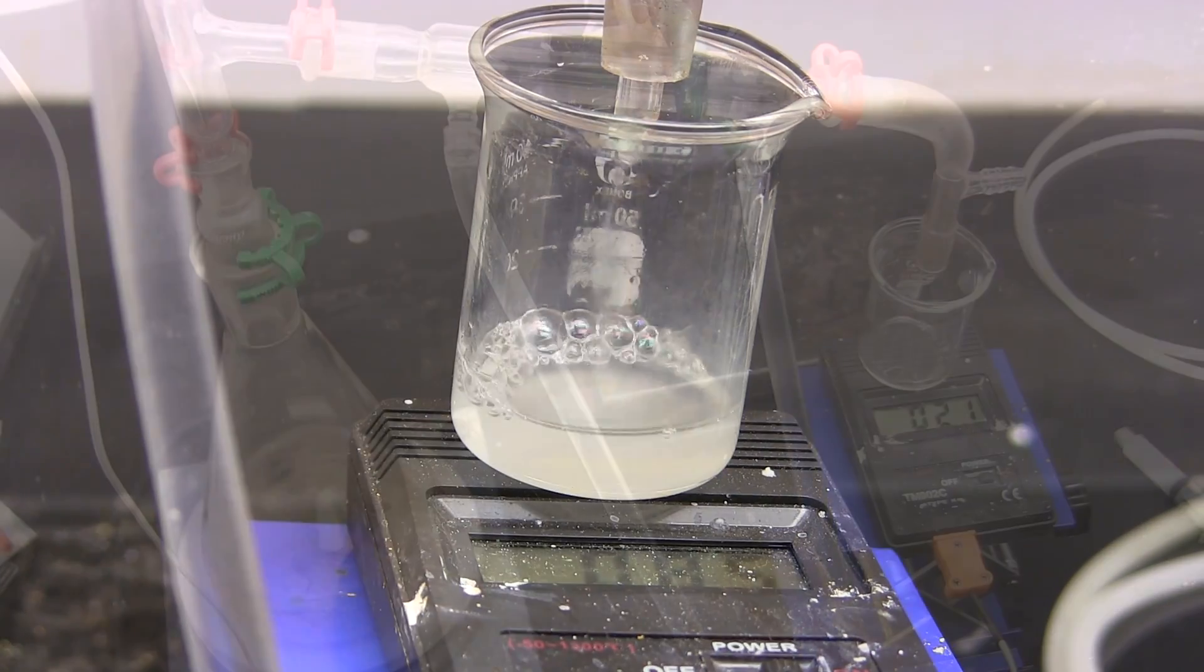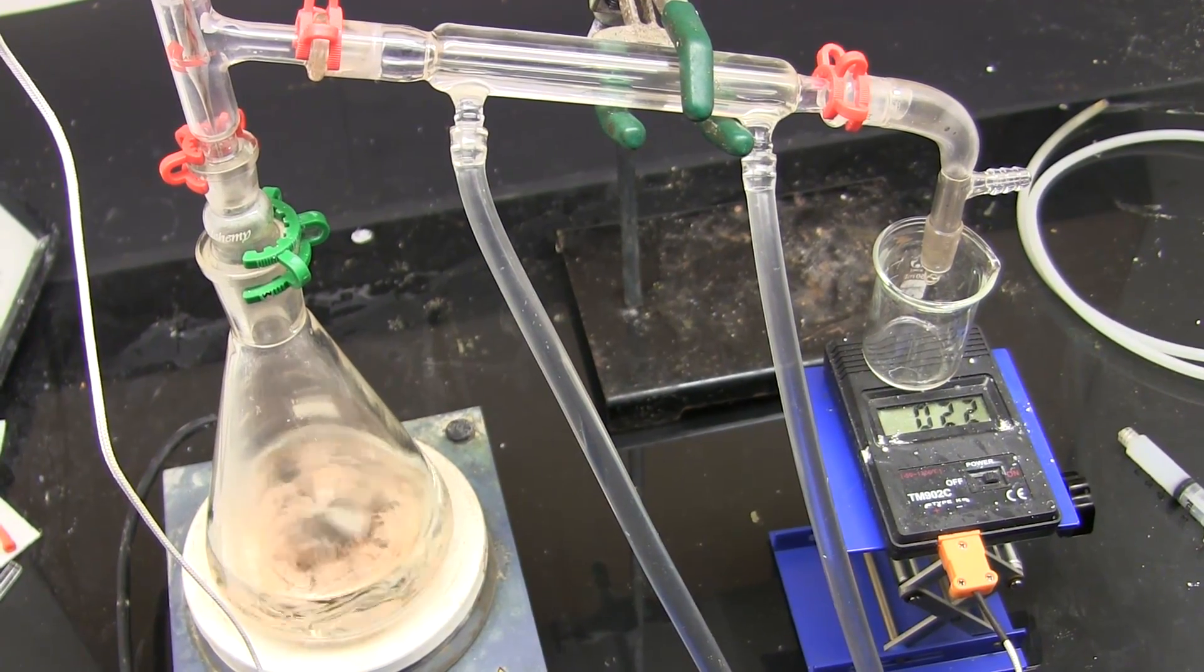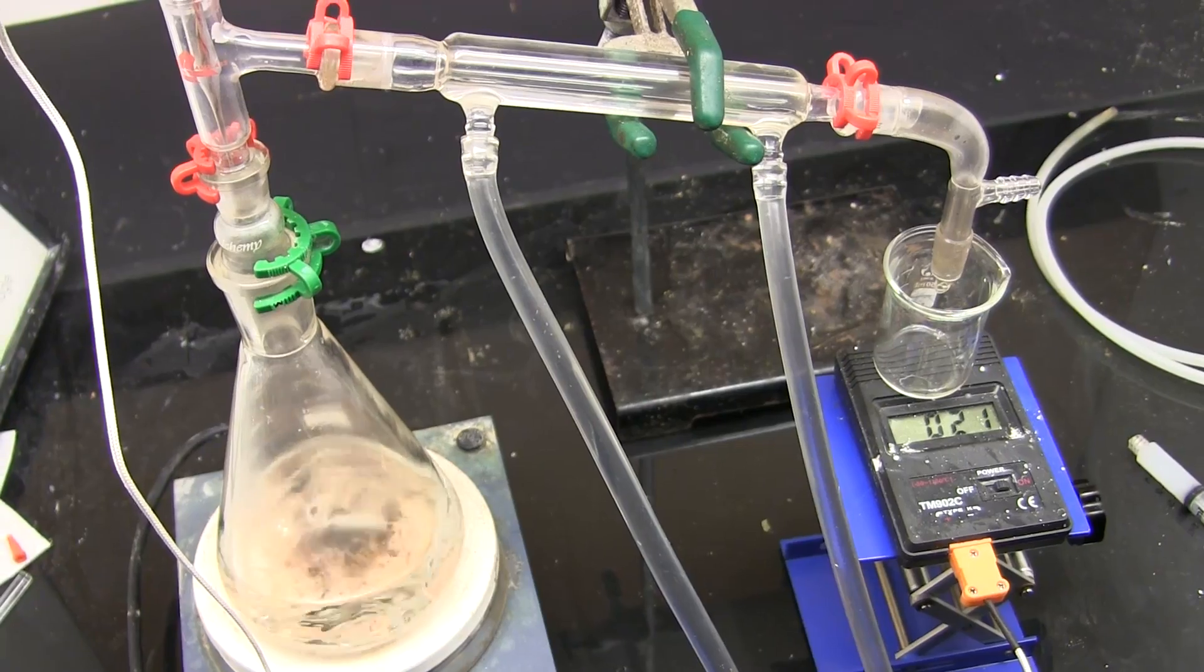Adding an easy to boil carrier solvent like toluene lets you boil out the water and separate it that way. Now a very difficult sample might take hours or even days of refluxing and returning the organic layer to get good separation.